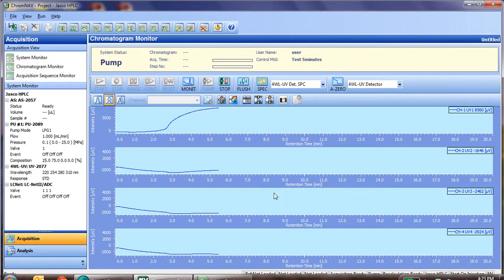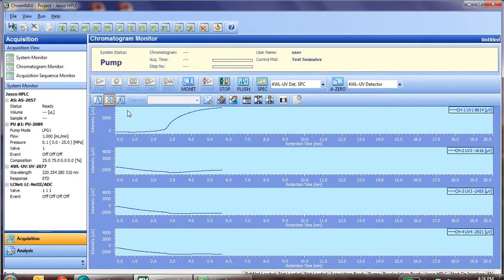Now that we've learned how to make a method and the system has been equilibrated, let's go ahead and start an injection. First, we'll learn how to do a single injection, and then we'll learn about sequence injections.